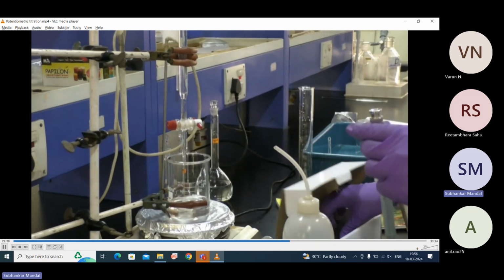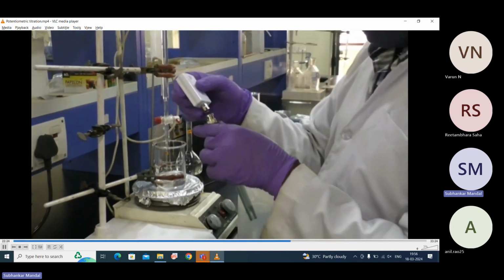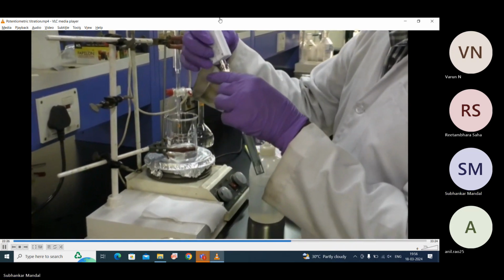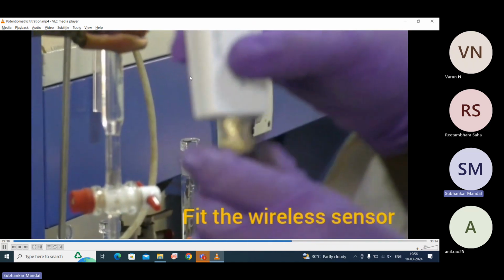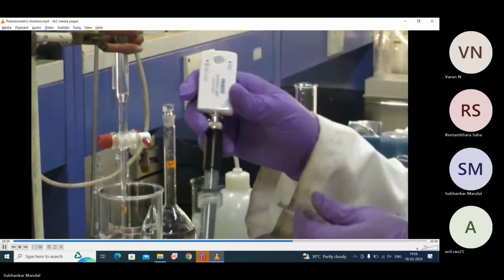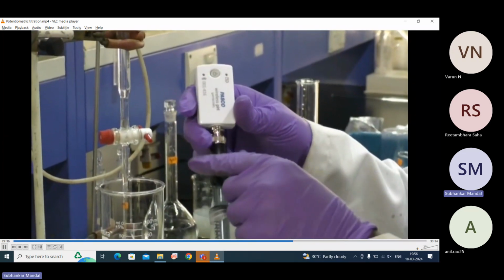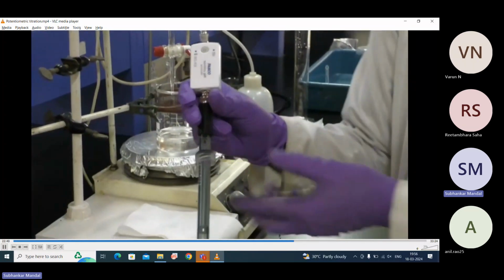Okay, then there is an adapter, which can connect your electrode with the software, with your PC. And there is one power button to switch on the device.